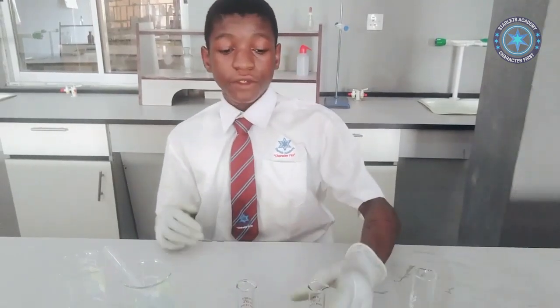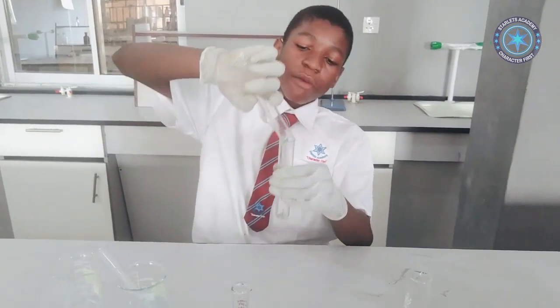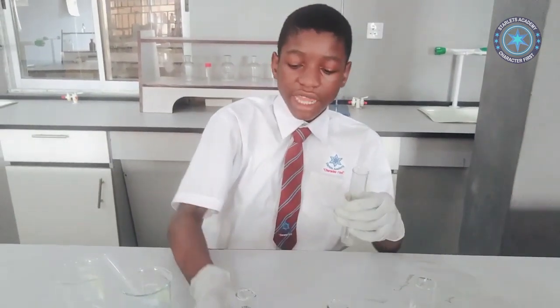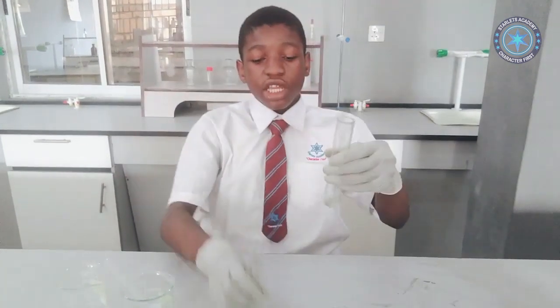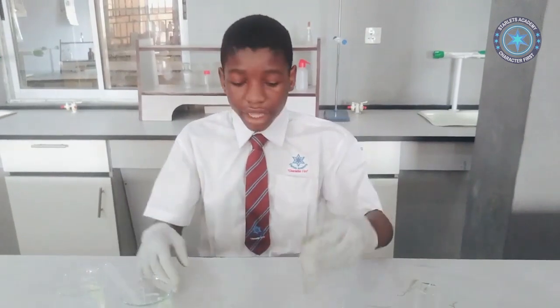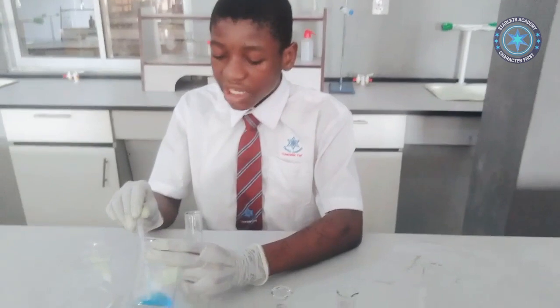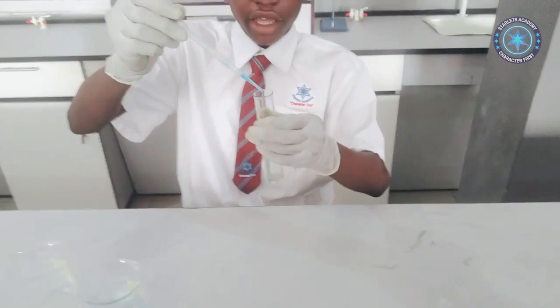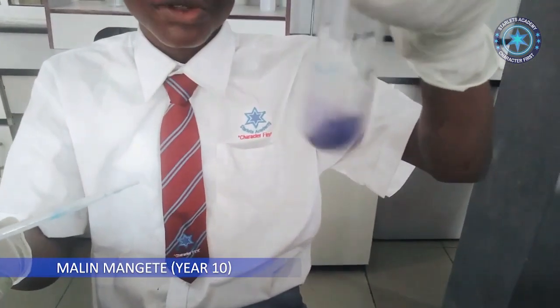So I get my solution and I get a test tube and pour my egg solution into the test tube. Then I get my sodium hydroxide into the test tube also and shake a little. Then I get my copper 2 solution with a pipette and pour it in here to show a color change of purple, and that's how you know that there's protein. So the test shows the presence of protein in egg whites.